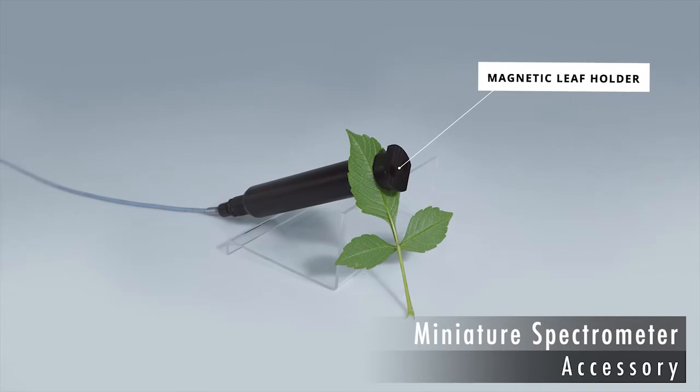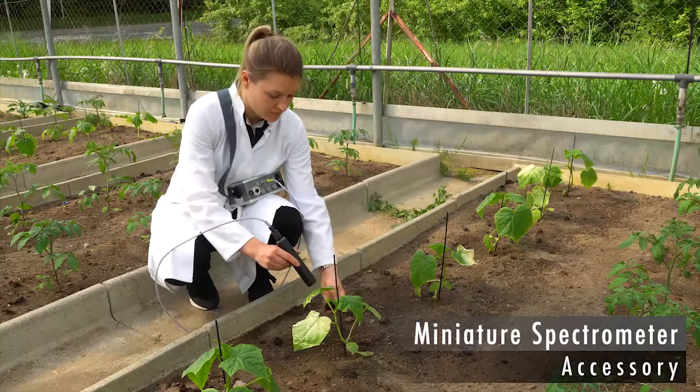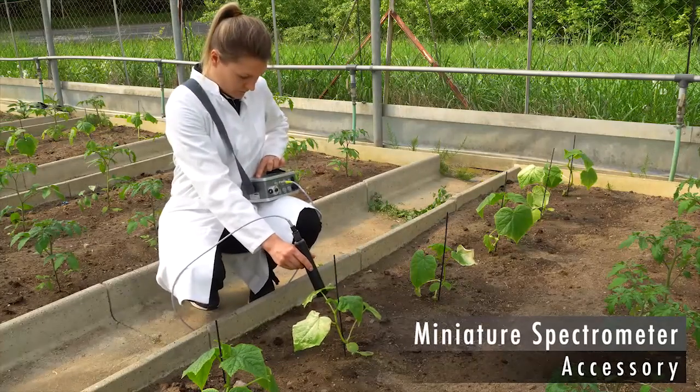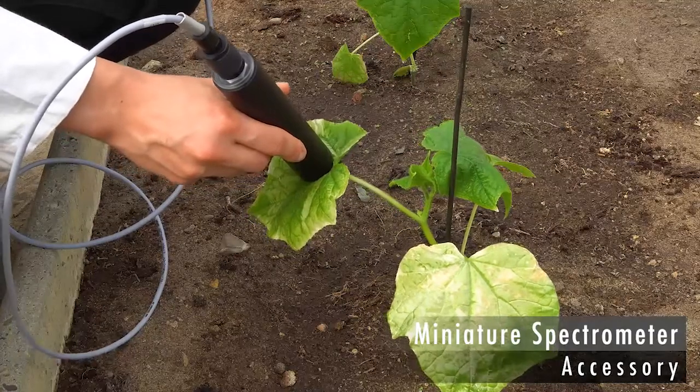A magnetic sample holder positions the sample. An example of an application of the reflectance spectra is a study of abundance of chlorophylls and carotenoids in senescing leaves.